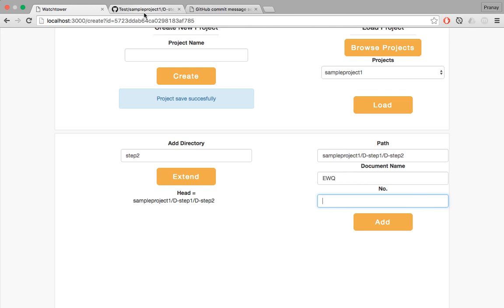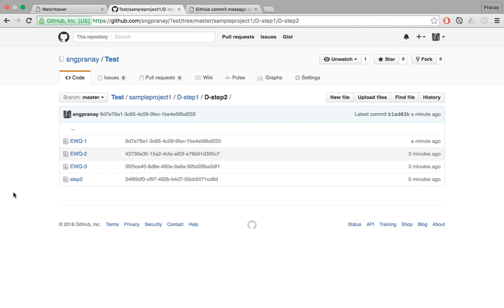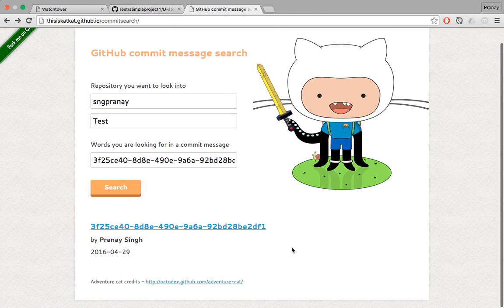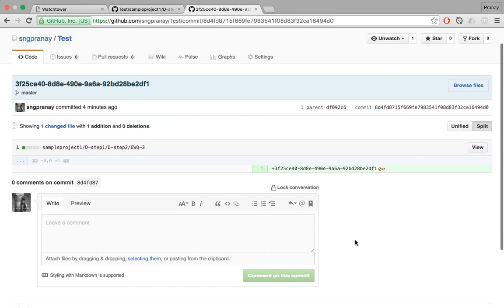So just as a test again, let's assume that someone in the lab 2 years down the line found a sample with this ID stuck on it. And he wants to find out what the hell that is, right? So he goes into the test repository for that lab and just copies down the ID which he found on the test tube, and searches for it. Boom. He has the ID for that, and it tells you the information.